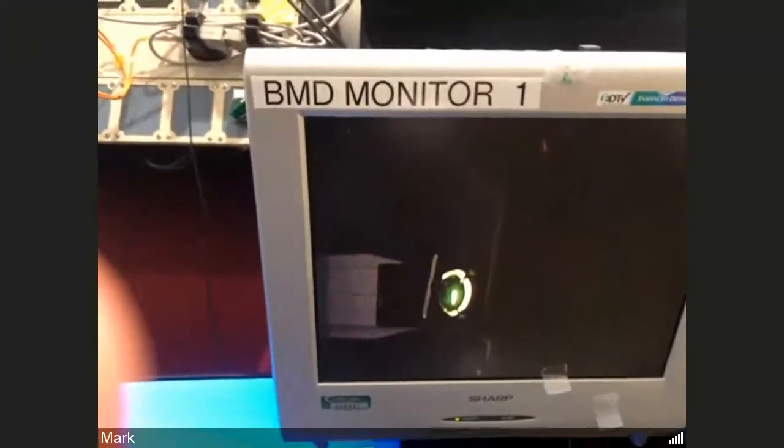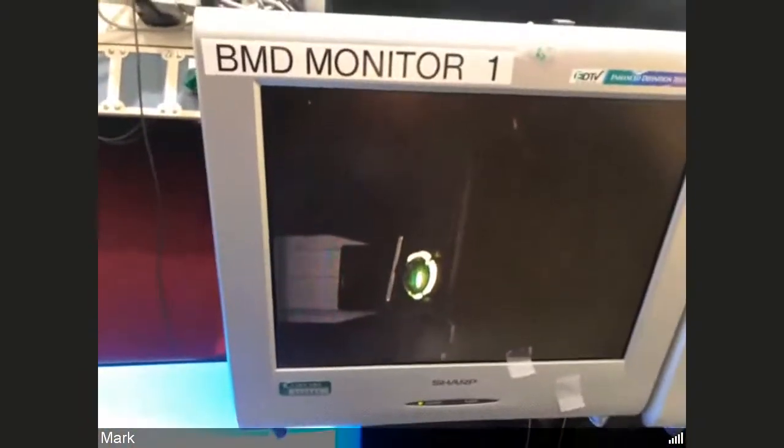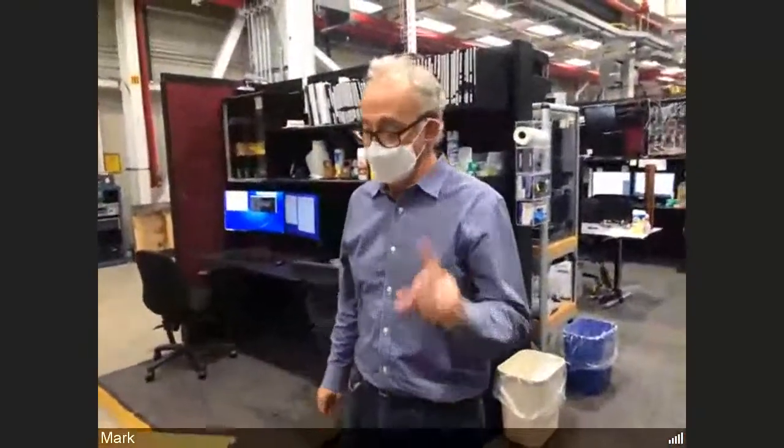So you can't really tell here where the beam is on the scintillator, it's just glowing so brightly. If I were to close the slits in the hutch to just 100 microns, and then watch the scintillator, now you can see where the beam actually is vertically. And horizontally, right now it's only 100 microns, but when I open it up, it's 11.2 millimeters wide. That's a 25 millimeter round scintillator. And what you're seeing on this monitor, which we'll see with VNC in my office, is the shadow of that sample. So on the left is the air, and on the right is the sample. And it's sample MM501. You got to remember that.